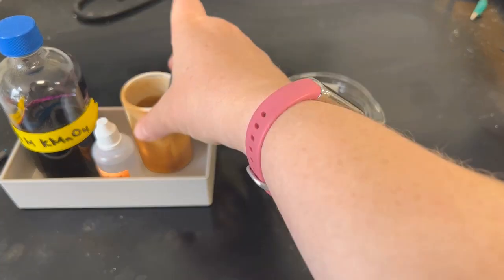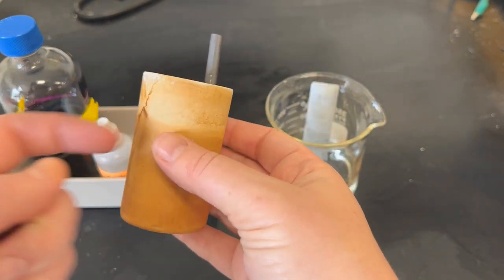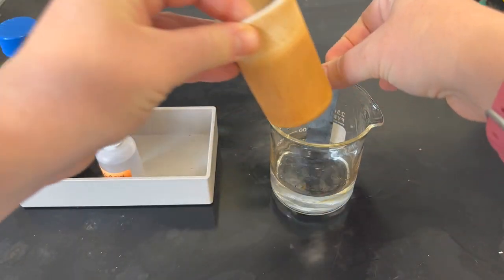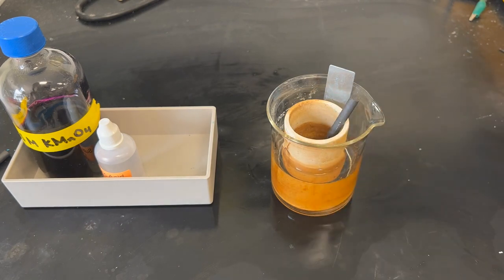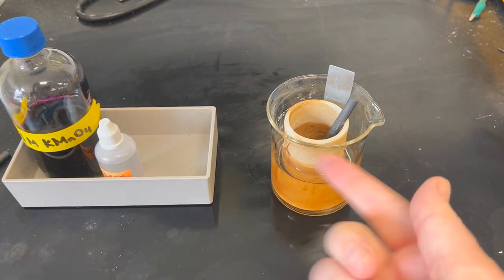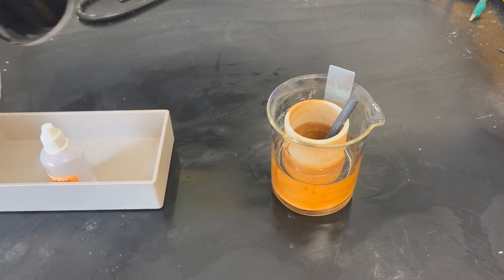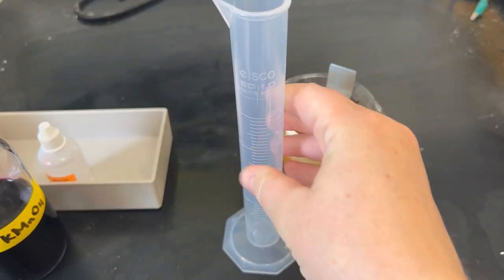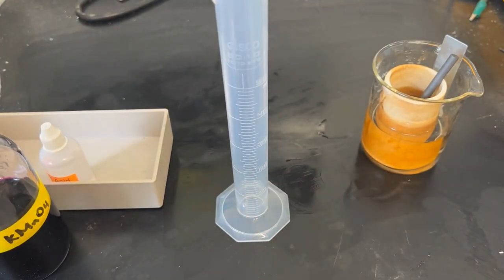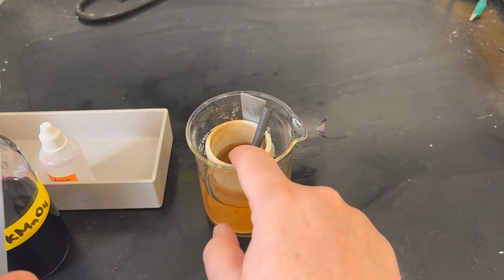Instead of using a salt bridge, we're going to use this porous cup. It's ceramic, and ions can flow in and out. That's going to go into your cup like this, with your carbon electrode sticking out of it like that. This will allow ions to flow and complete the circuit like our salt bridge did. For this experiment, you're going to need about 25 milliliters of your KMnO4 solution. So you'll use the graduated cylinder here and measure out roughly 25 milliliters. I have about 25 milliliters, and I'm going to pour that into the porous cup.